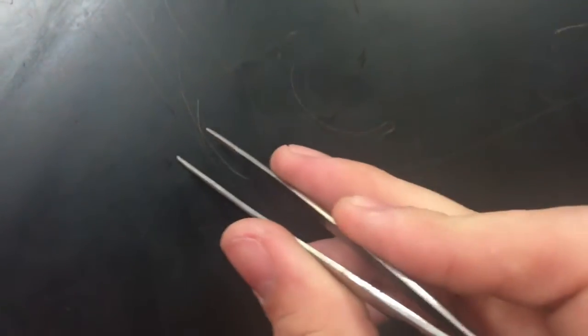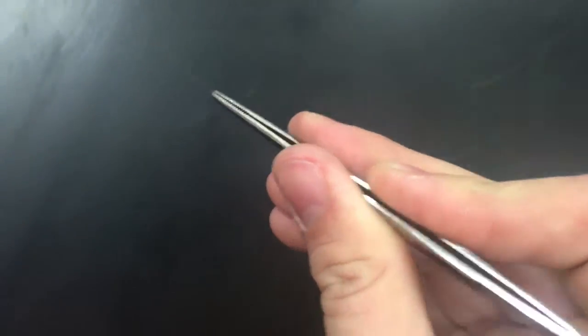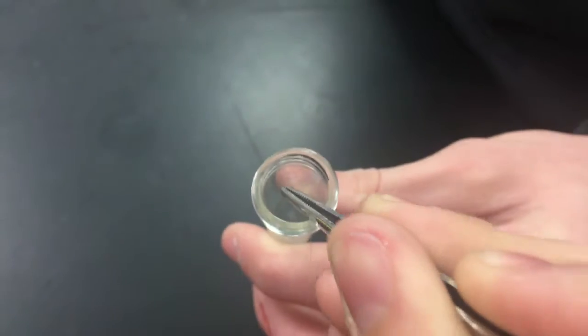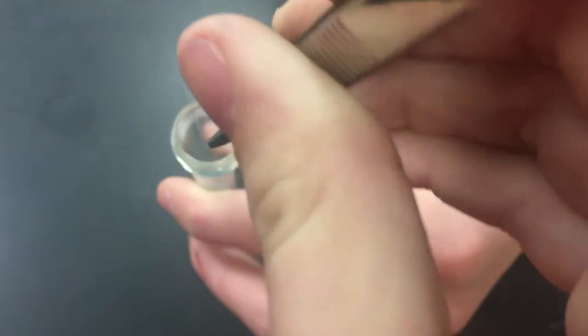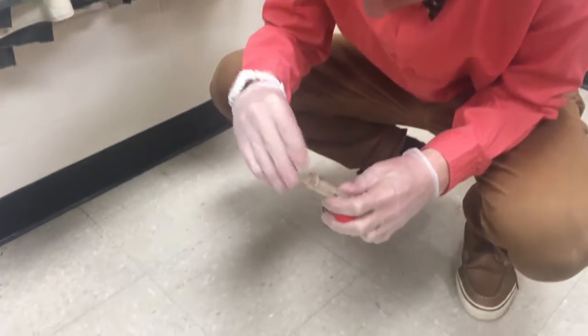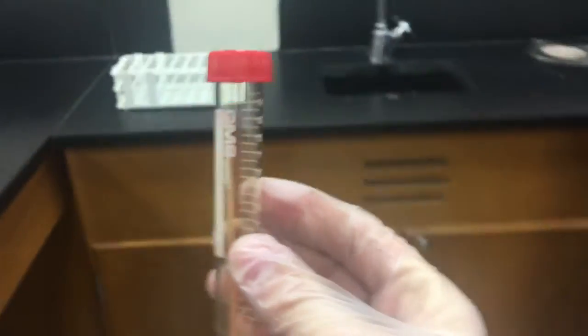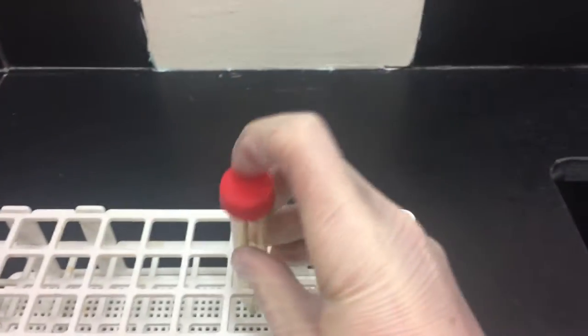There are many ways DNA evidence can be collected. One is through the collection of hair follicles. Another way is through the collection of blood samples. Forensic scientists use swabs to collect even the smallest amounts of blood. The evidence is then taken to the lab for analysis and profiling.